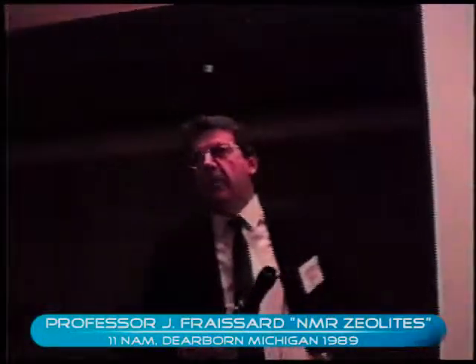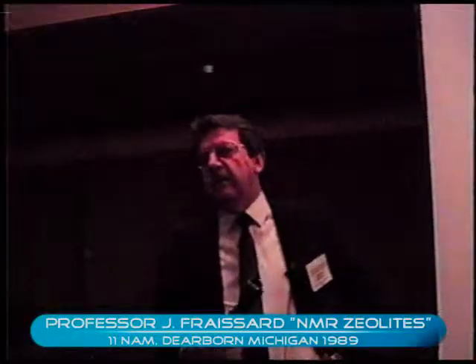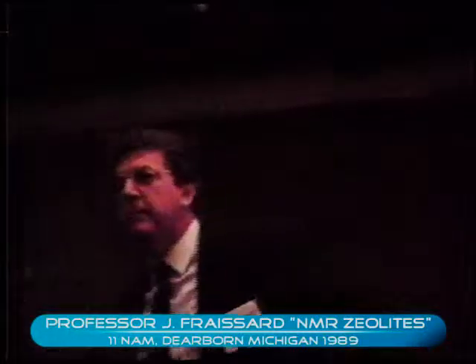Okay, so I assume that you are all specialists of zeolite, and so that you know more or less the technique that we have developed in our lab during the last 5 or 6 years. This technique concerns the adsorption of xenon used as a probe for determining some zeolite properties which cannot be determined using the conventional physical-chemical techniques.